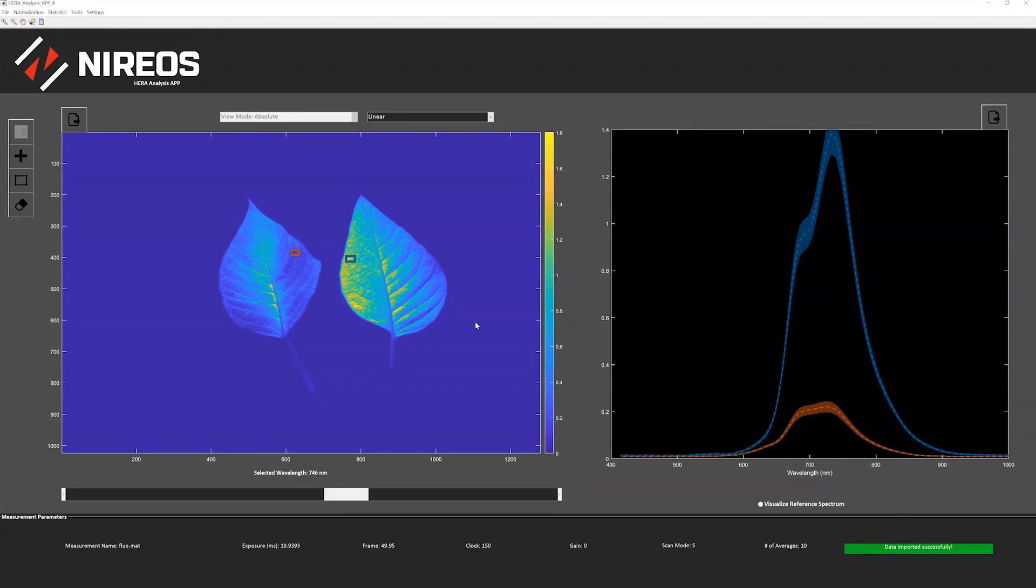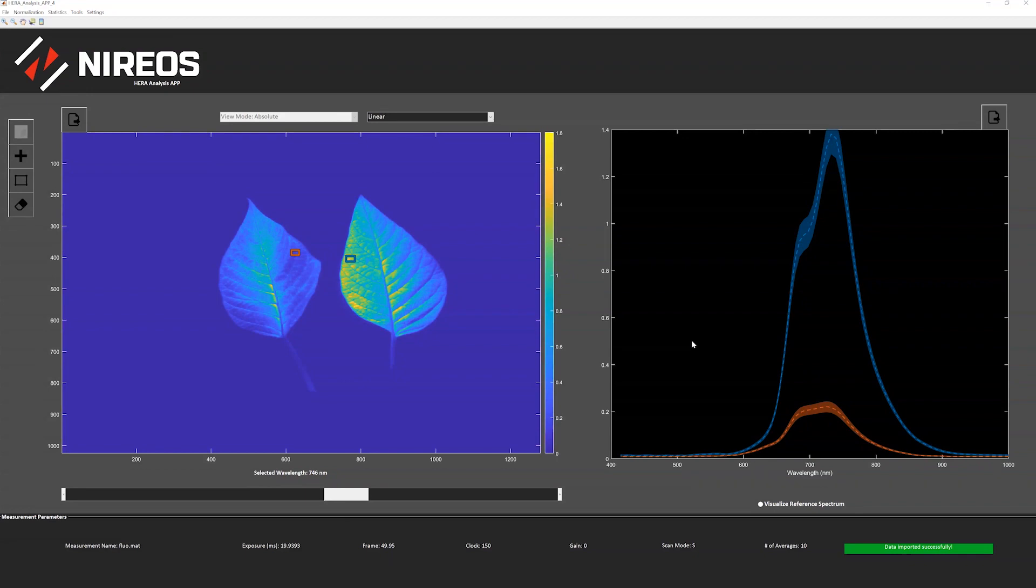It is possible to characterize the leaf and the health of the leaves by looking at the fluorescence signal that they emit. We can select the background spectrum here, which basically is totally flat in the overall region.